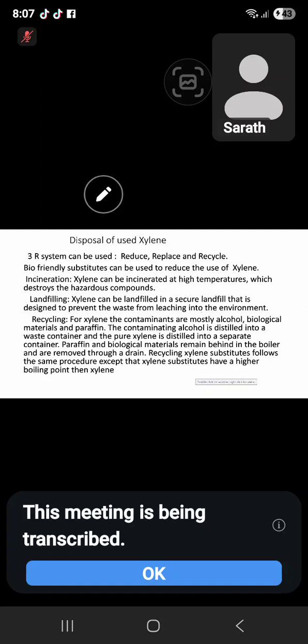Right now, there are three methods to dispose or control xylene. Number one, reduce, replace, and recycle. Second, incinerate the xylene at high temperature. Third, landfilling. These are the ideal ones. But in the Sri Lankan setup, I have seen this is not practiced. That's a very sad thing.